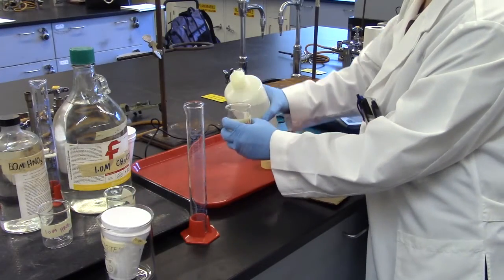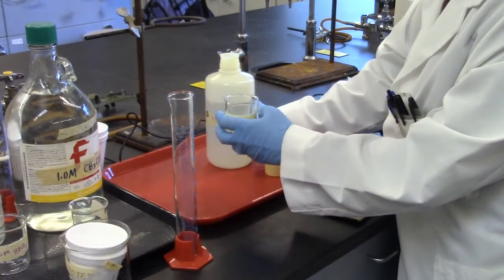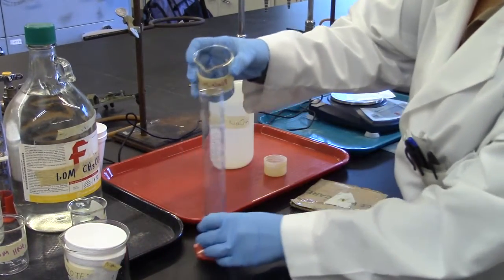Measure out 50 milliliters of sodium hydroxide into a 100 milliliter graduated cylinder.